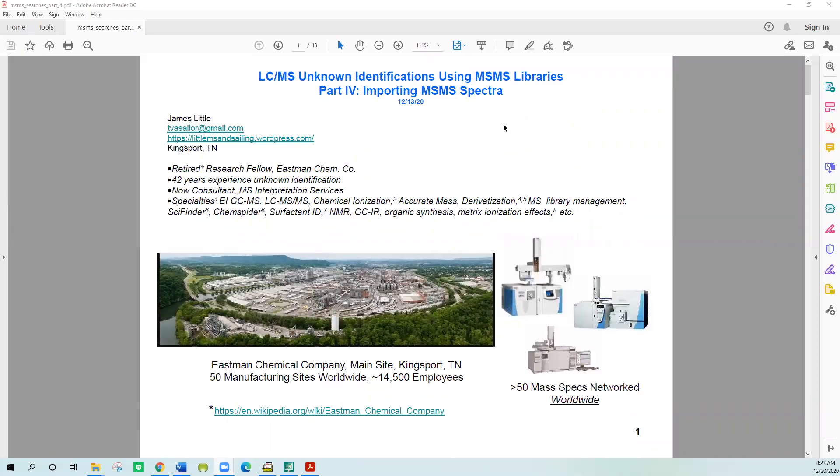Good morning. Today I would like to share part four, importing MS-MS spectra, as a webinar I'm producing to share with people about LC-MS unknown identifications using MS-MS libraries.